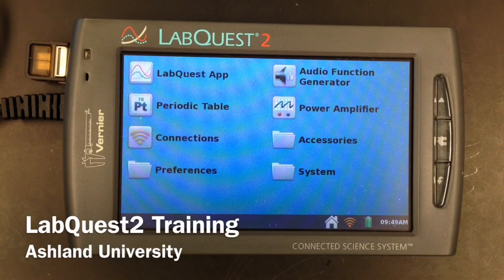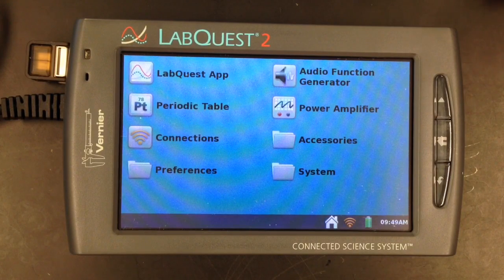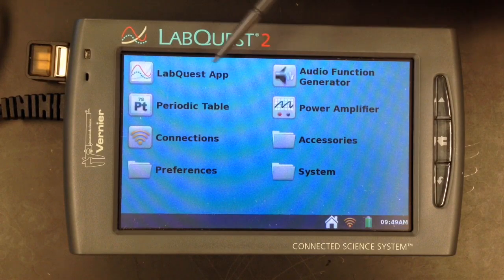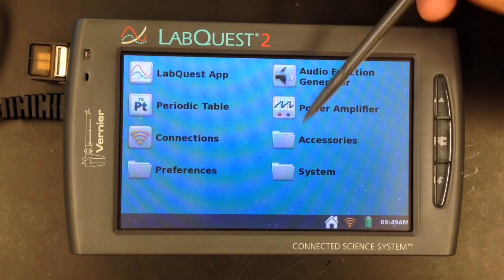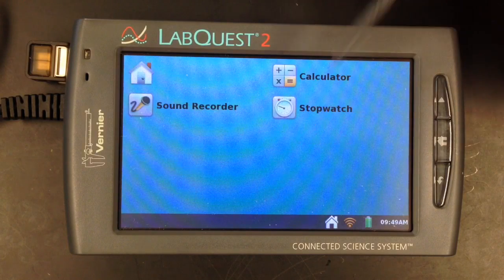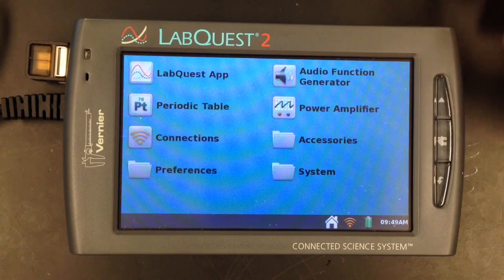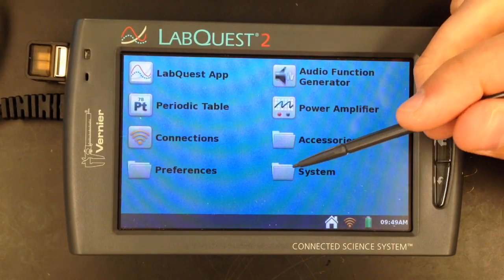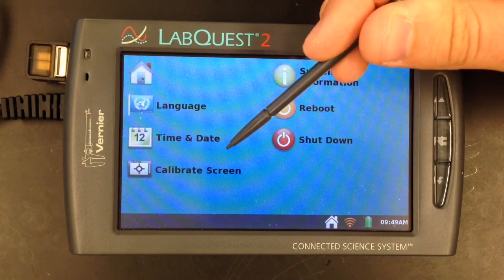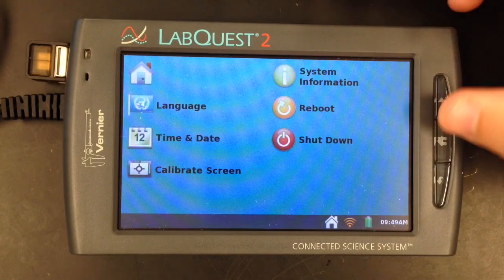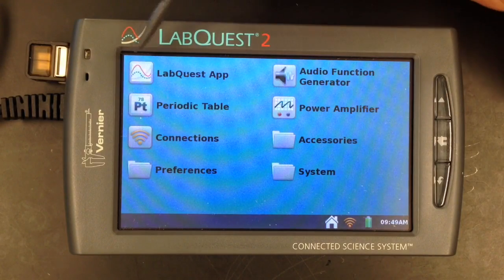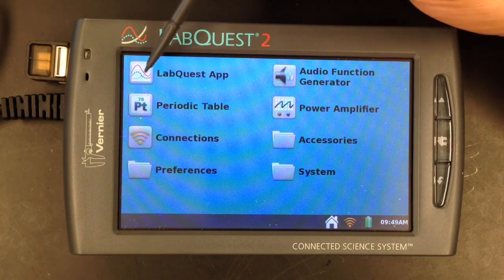This video will show you the basics of collecting and analyzing data using the Vernier LabQuest 2 system. On the home screen, you can see all the apps that are built into each LabQuest 2. There's a periodic table app, and under the accessories folder there's a sound recorder, a calculator, and a stopwatch. Under the systems folder there is a recalibrate option if the screen is not responding properly. The main app you'll be using is the LabQuest app, located in the top left.